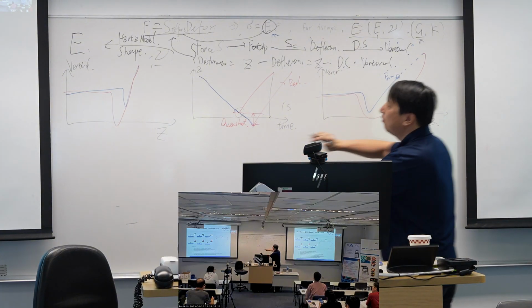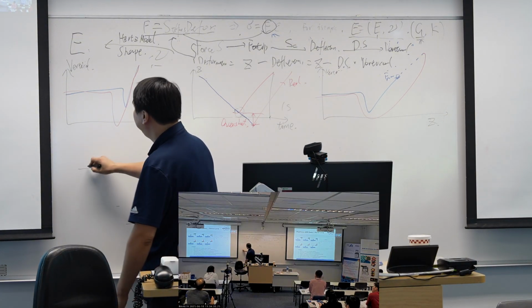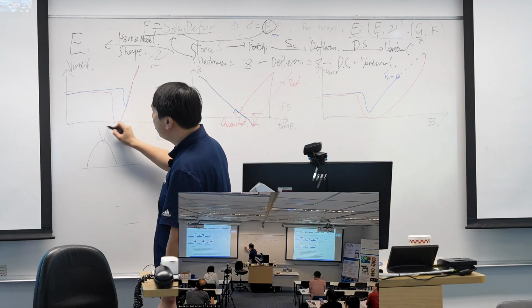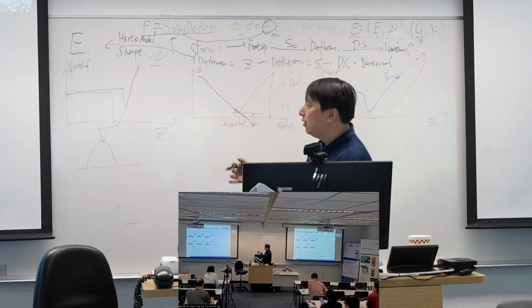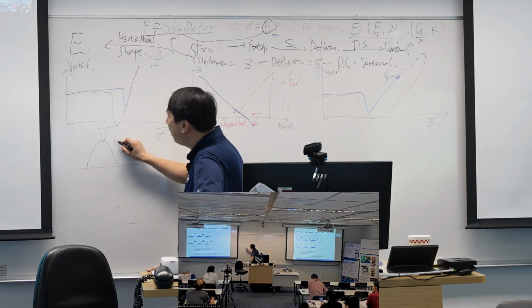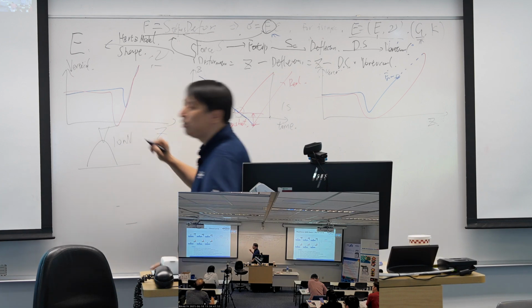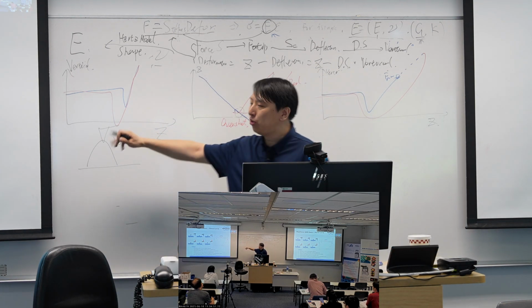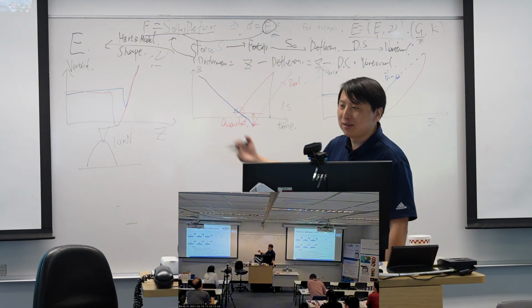So for example, if we have a cell and we want to measure the modulus of your cell, and your experience tells you the cell can only hold 10 nanonewton, after which your probe will penetrate your cell and kill it.